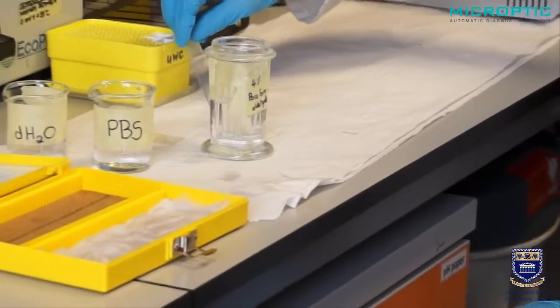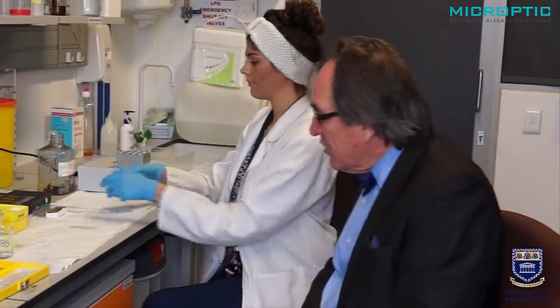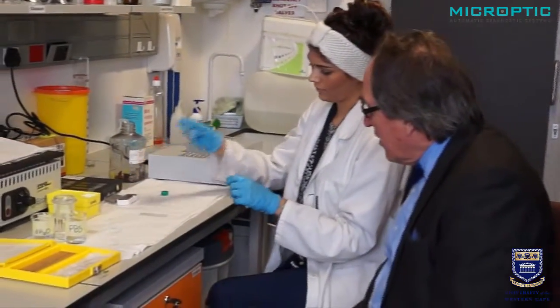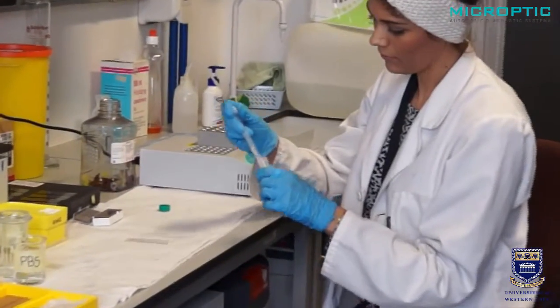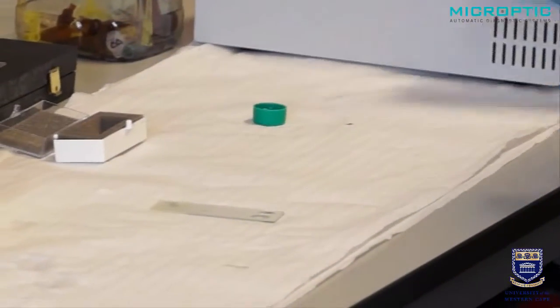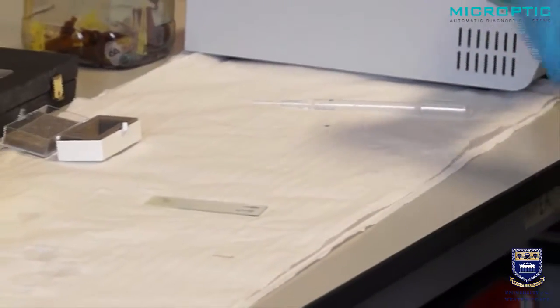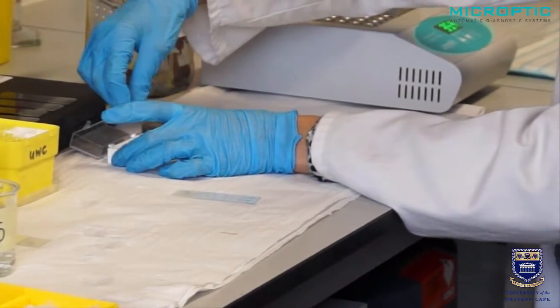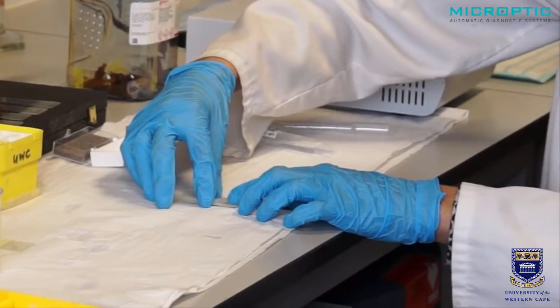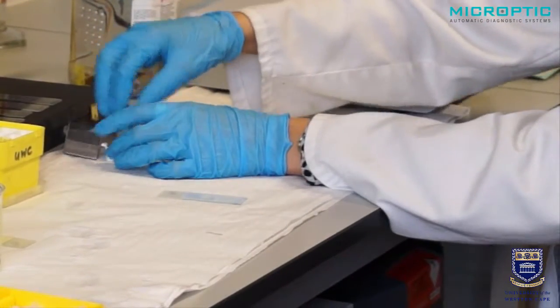We're going to mount it in a special anti-fading medium. Under the fluorescent beam, one tends to have a lot of fading occurring, so it's important to use an anti-fading medium — there are many types available. A drop each, and we can mount it with a cover slip. It is now ready for viewing.